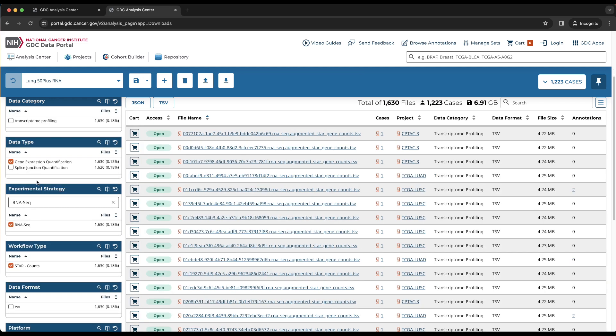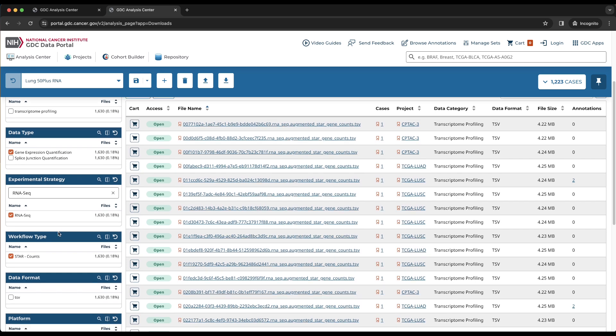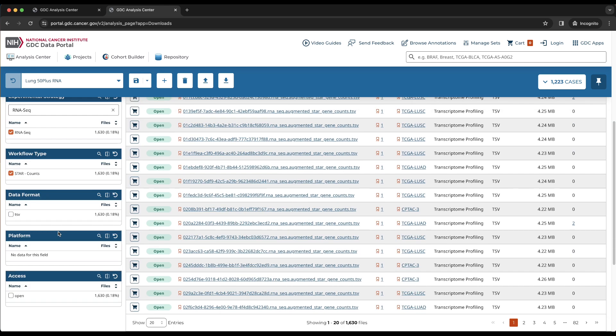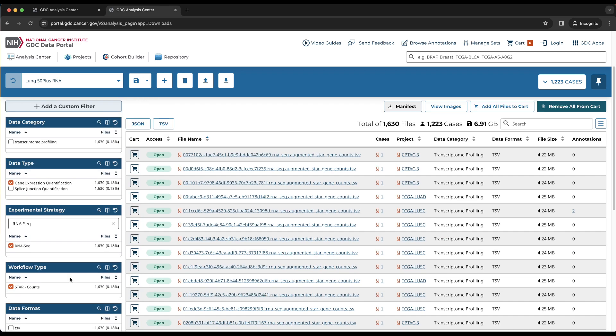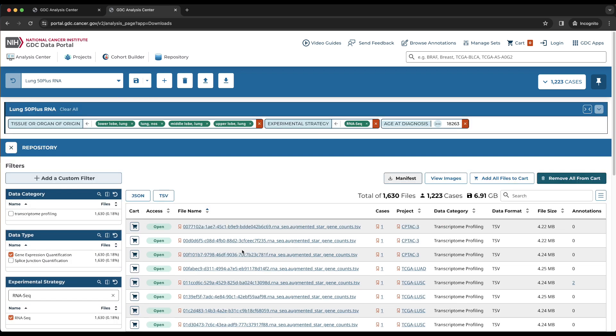Scrolling down to the access card, we can see that open is the only available option, which indicates that the list we have filtered only has open access files. There are 1,630 files across 1,223 cases, which gives a total of 6.91 gigabytes. This time, we will add these files to the cart.